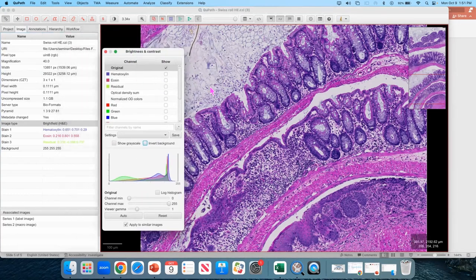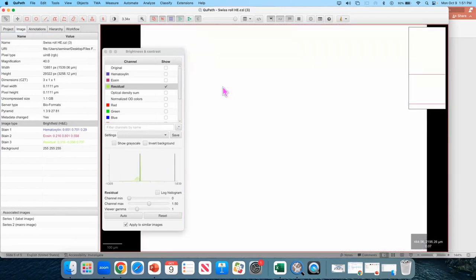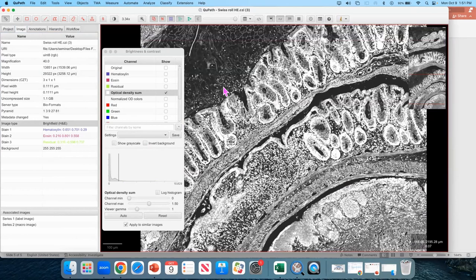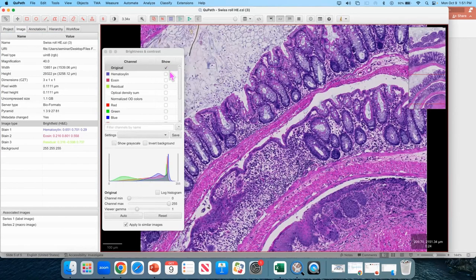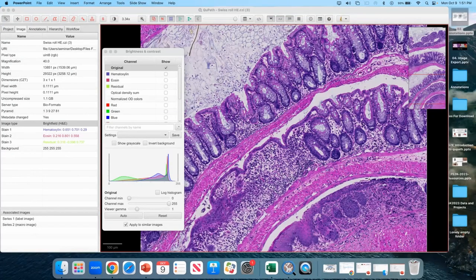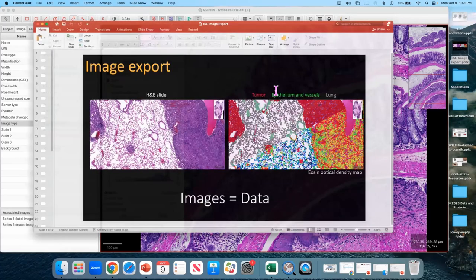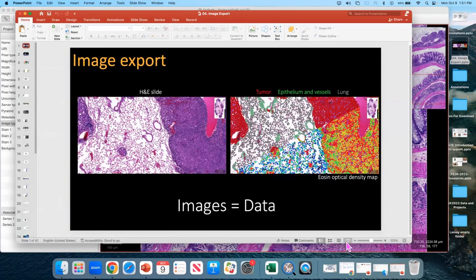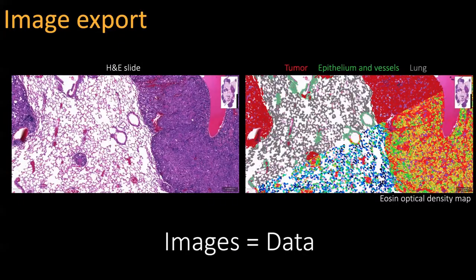With keyboard keys 1, 2, 3, 4, 5, and so on, you can switch between image channels. Now this is a red, green, and blue image — an RGB image — and it's actually a little bit of an oddity, so I'm going to show you a little presentation now.